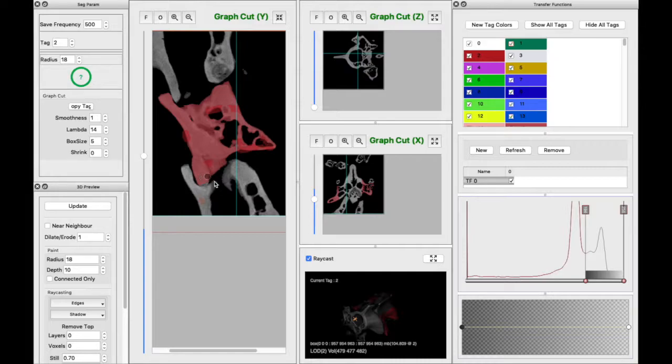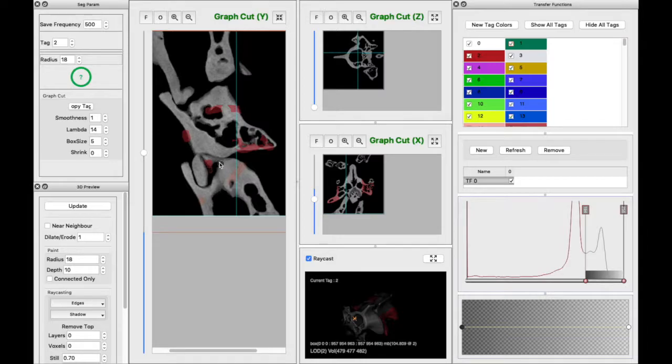And I think this piece is going to break off at some point. And is that part of the vertebrae? No, that's part of the other vertebrae that we don't want. And I'm just going to put a preliminary piece of 255 over there as well. Oh, and see, that I think could be part of this. So that's actually the last place. I'm probably going to let it tag over there. But we do want it to tag right there.